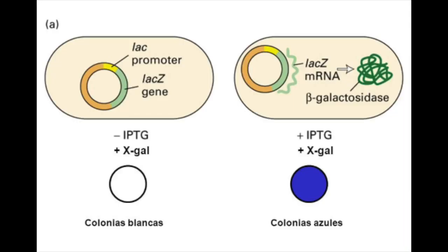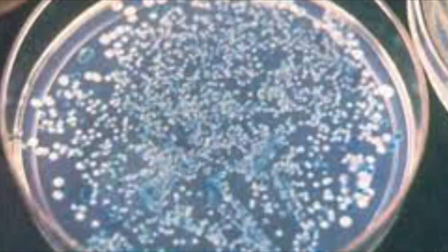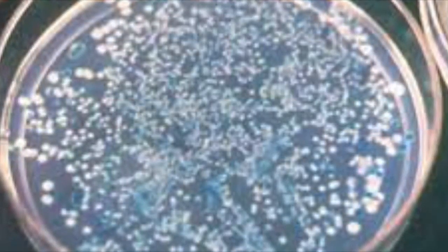There exist different ways of screening, which include the following. Blue-white screening, a popular technique which consists of the insertion of a gene into a vector containing a lac sequence. Positive selection vectors express a lethal gene, and when the insert has been cloned into the vector, it disrupts the multiple cloning site and only cells with recombinant plasmids are able to grow. Sequencing, the most accurate way, with appropriate sequencing primers and the Sanger sequencing method. Emphasizing the color screening, it is not 100% reliable, because this method can throw false positives due to the ORF being undisrupted.